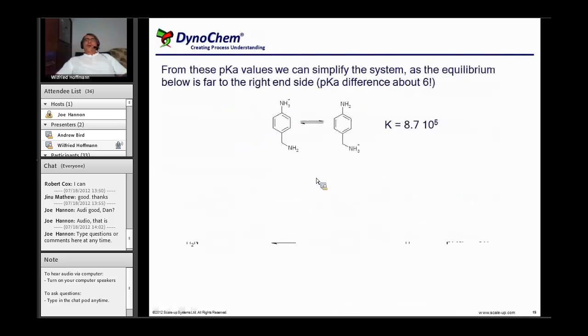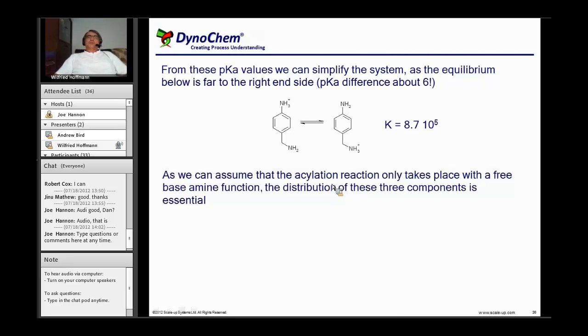You may also ask for a species where you have the aniline protonated and the benzylamine is not protonated, but that is only a theoretical species. You can easily see from the difference in the pKa that once you generate this species, it will be in equilibrium with the other species and that equilibrium is far on the right-hand side. You can calculate from the differences of the pKa that equilibrium constant, so we can ignore this compound. What remains is the species where we have either both nitrogens protonated, a species where just the benzylamine is protonated and the aniline nitrogen has free electron pairs, and the species where both nitrogens have free electron pairs.